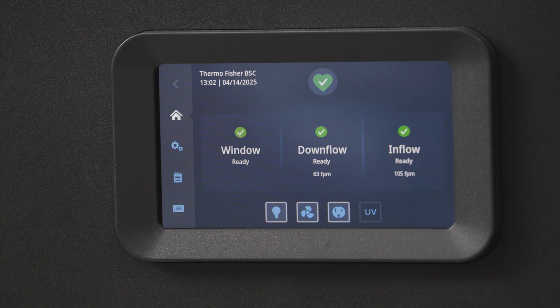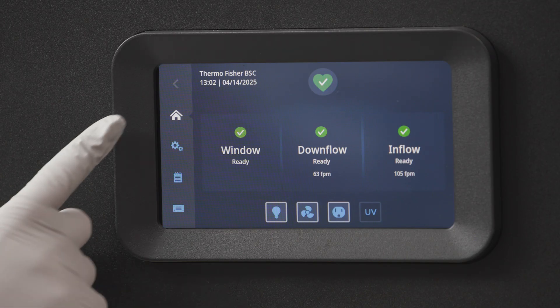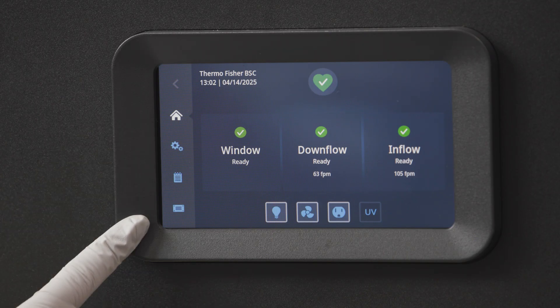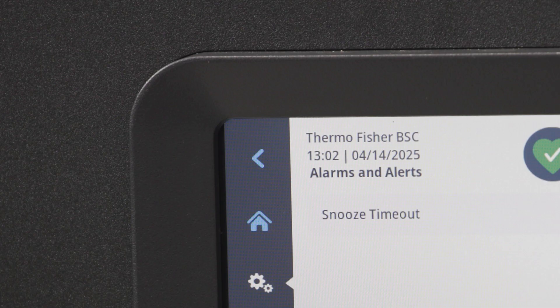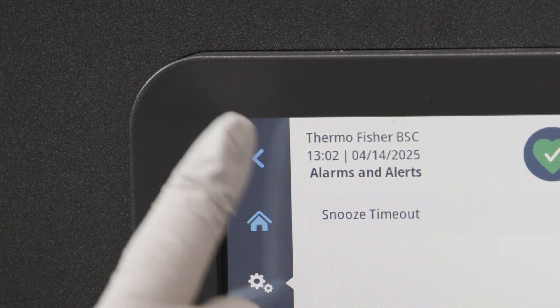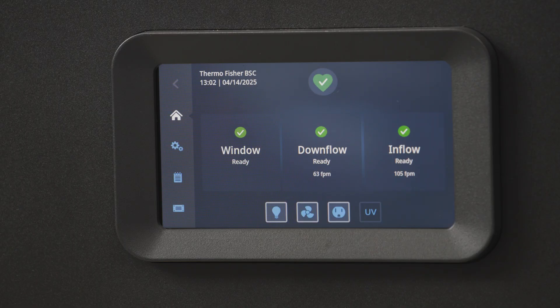To the left side of the display, you'll see the menu icon. To leave the menu, touch the return arrow at the top of the screen. Now you're at the home screen.